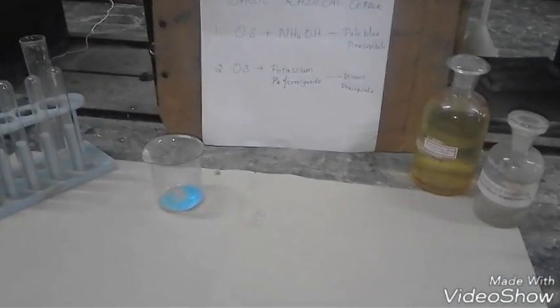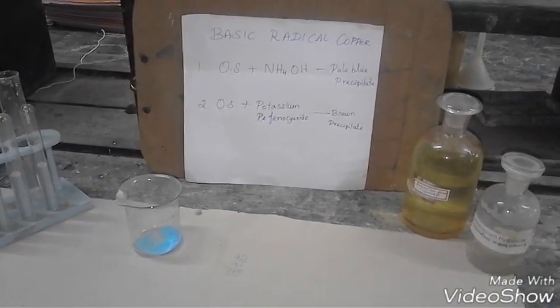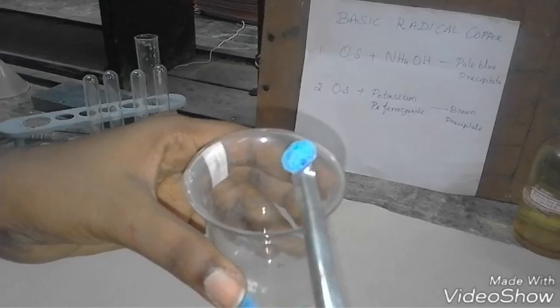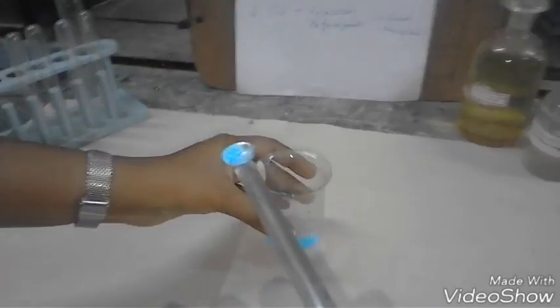Now we are going to see how to identify the basic radical copper. Usually the copper is blue in color, so we can easily identify it by its color. Take a boiling tube and put a small amount of copper sulphate into it.